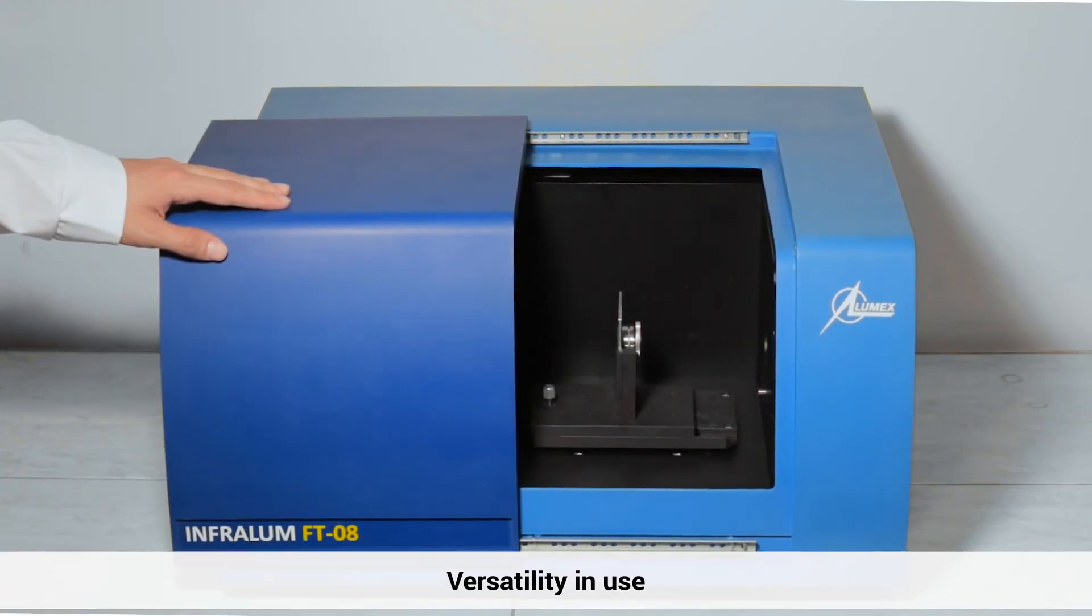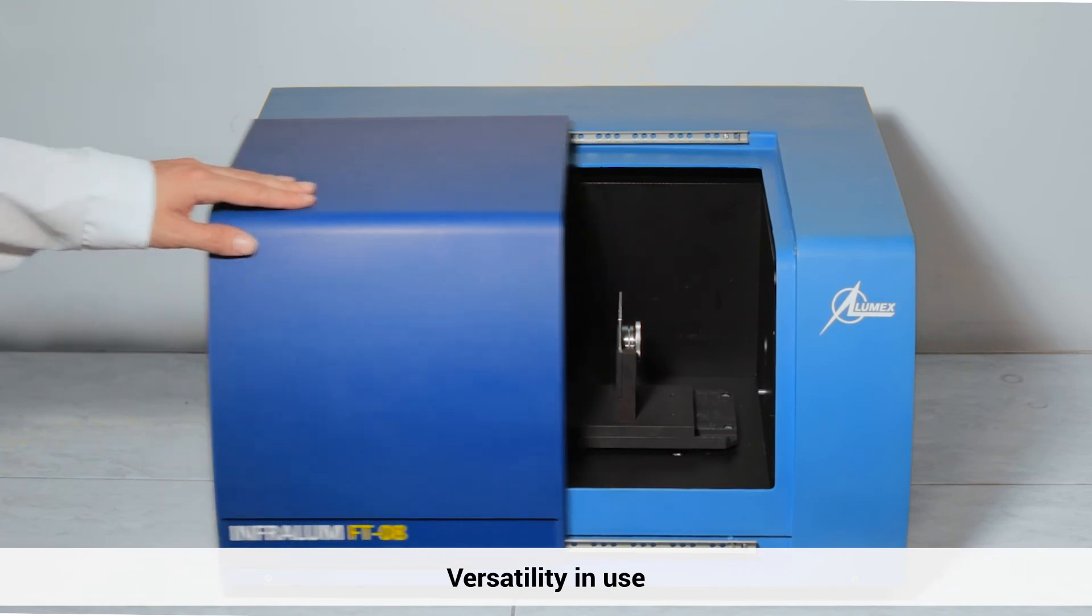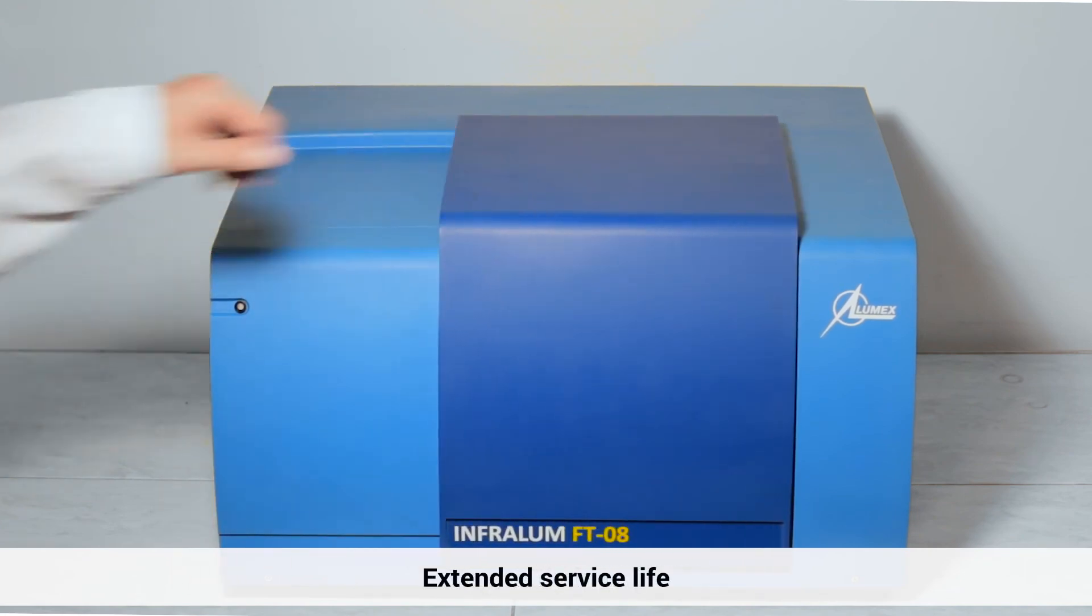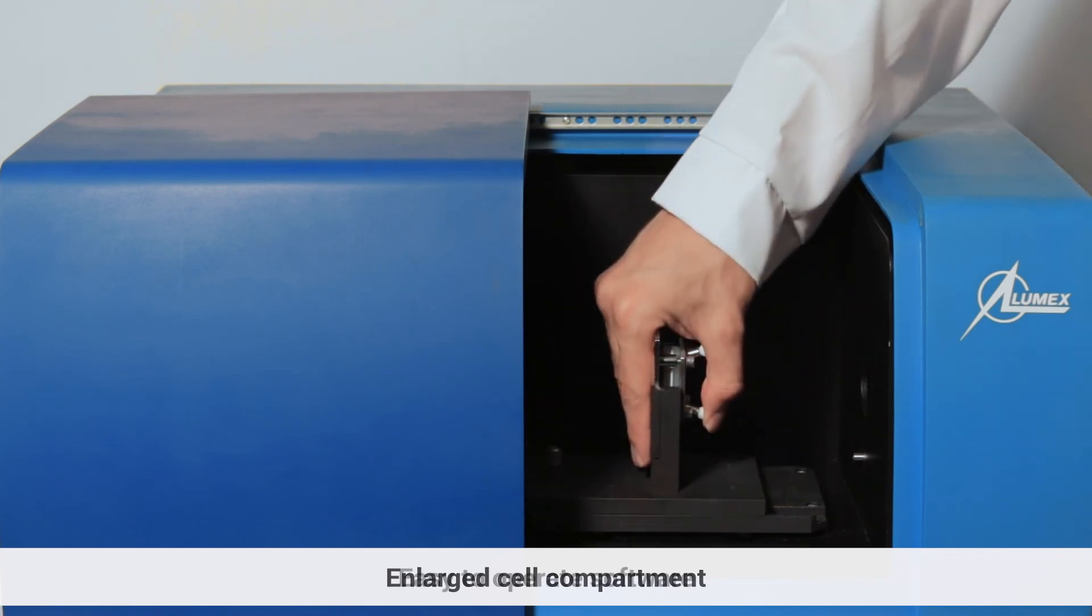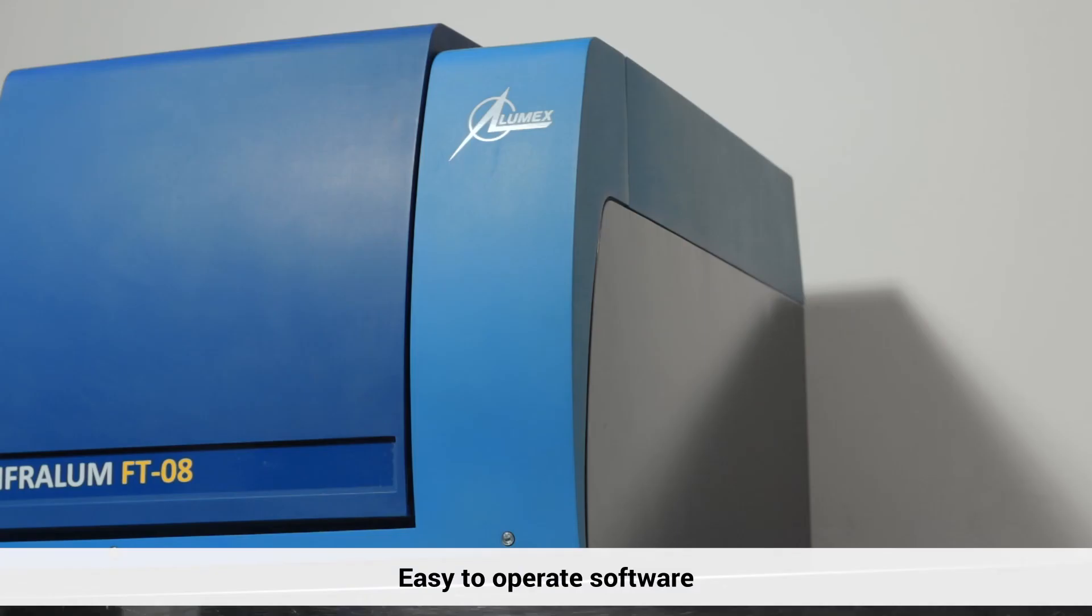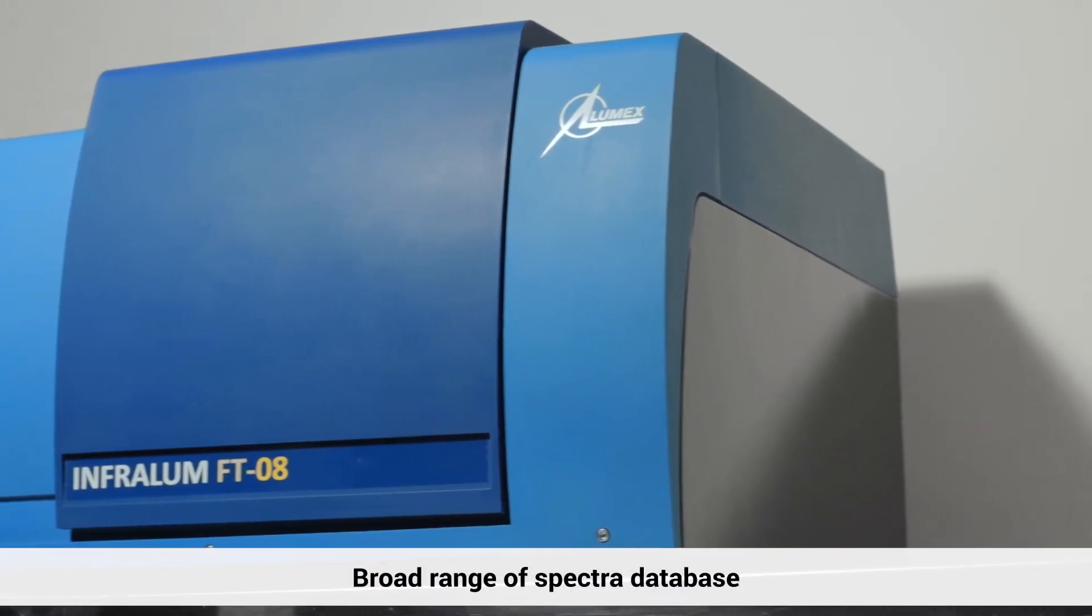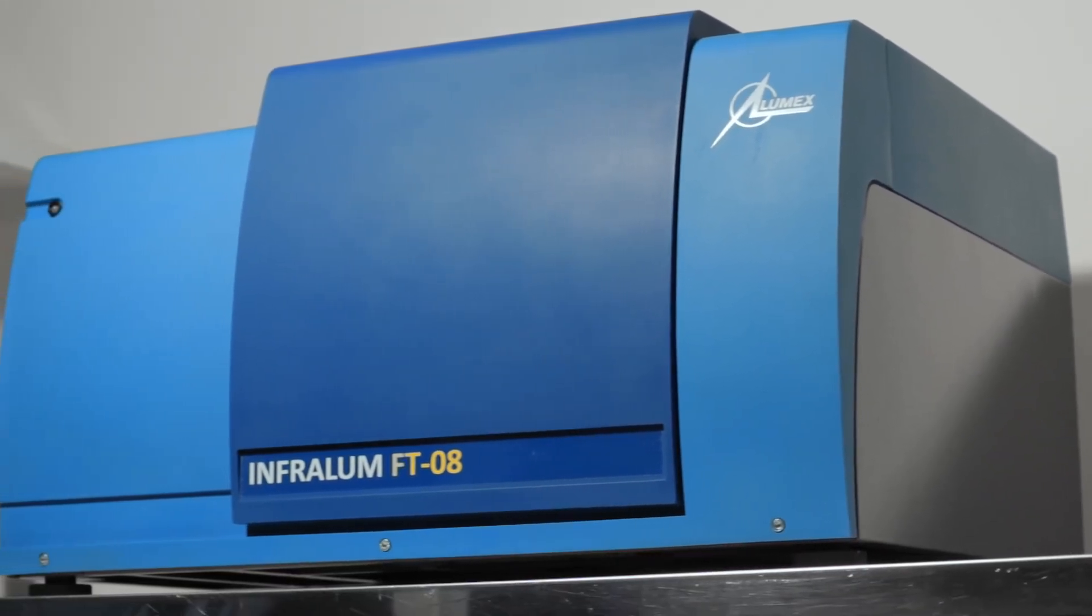As you can see, the Infralume FT-08 spectrometer and its software are extremely easy to operate. Please contact one of our representatives to find out more about the instrument and its wide range of applications. Our knowledgeable specialists will help you make the right choice for your lab.